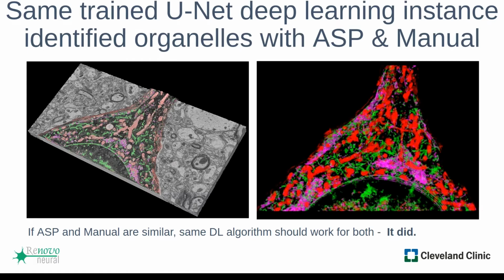It was very quickly trained on only 3 slices of data. And although there are some bits that need to be improved, it was the same for both and not related to the staining. So, for example, since this was a quick example, you can see that it picked up some features in the nucleus, but it would be easy to initially train it to find your nuclei and then mask them out and then do the segmentation and quantification. Also, simply training it on more than 3 slices would get rid of most of the issues. But we were just trying to see how badly could you do this and still see if it's still going to work.